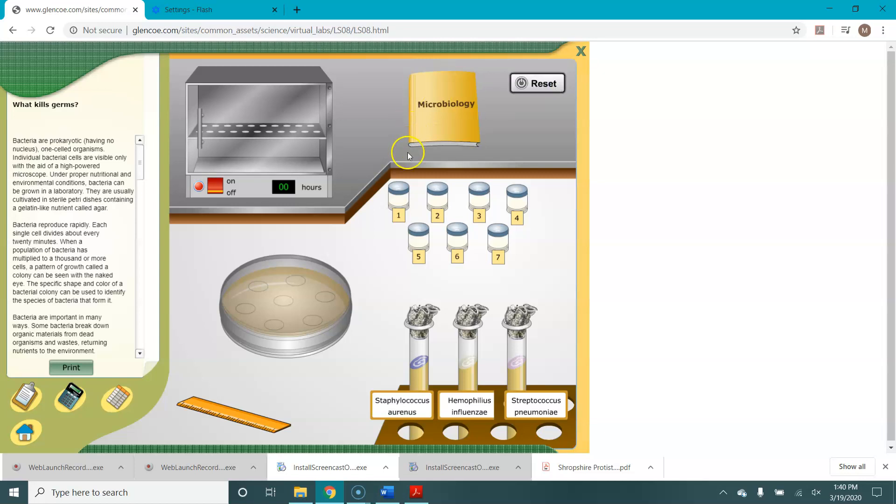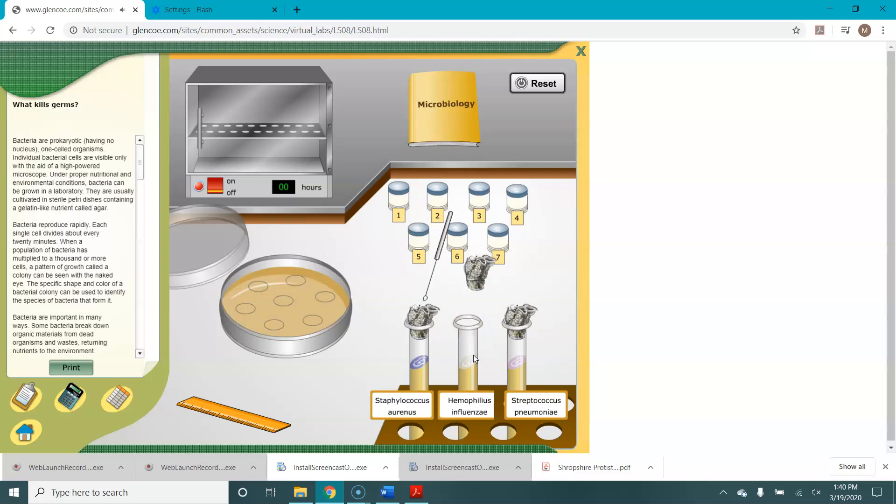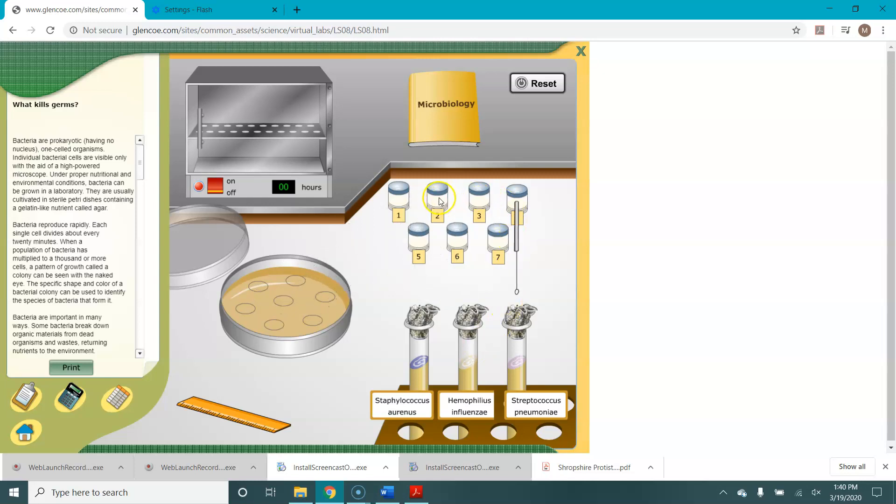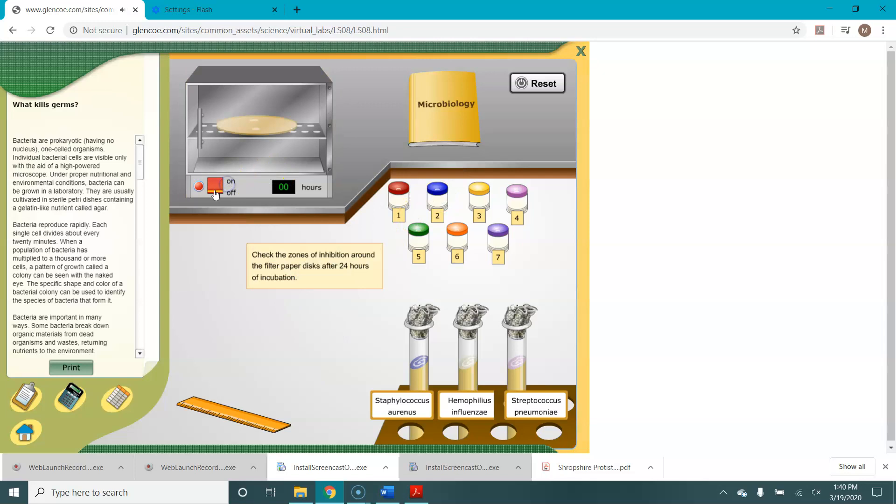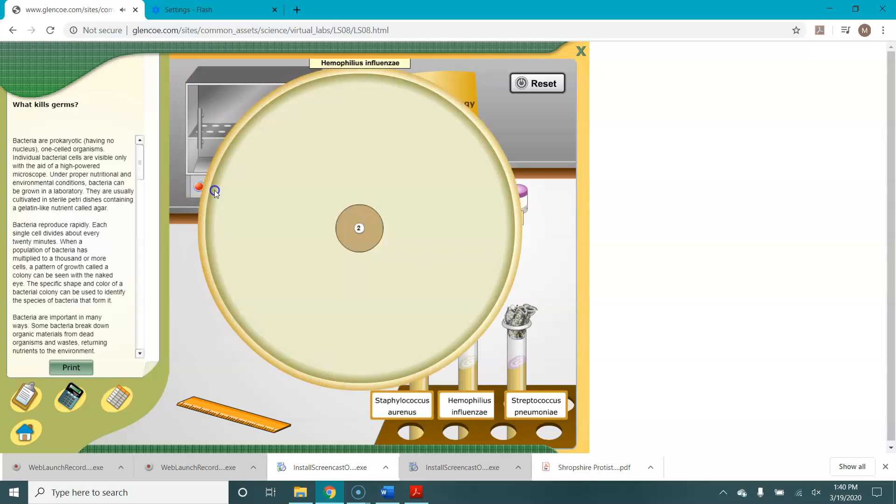Now you do the same steps with the next two bacteria, but there is something I want to show you with these. With Haemophilus influenzae, I'm just going to put one disc on this one to make it simple. So let's say we just put one disc on, put it in the incubator, incubate it real quick, bring it back out.